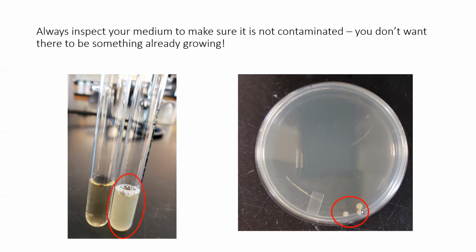Those three circles there are called colonies. Colonies grow on agar plates. Essentially what happens here is an individual cell landed where each of those colonies are. So 3 single cells originally gained access to this plate. And over time, about every 20 minutes, those cells would divide. So you go from 1 cell to 2 in about 20 minutes or so. And then you go from 2 to 4, 4 to 8, which we still can't see with the naked eye, right? They're too tiny.